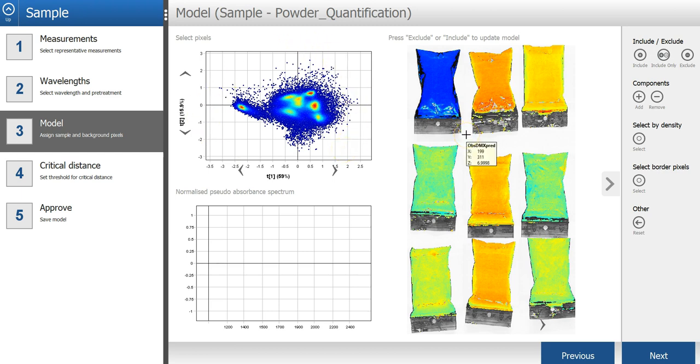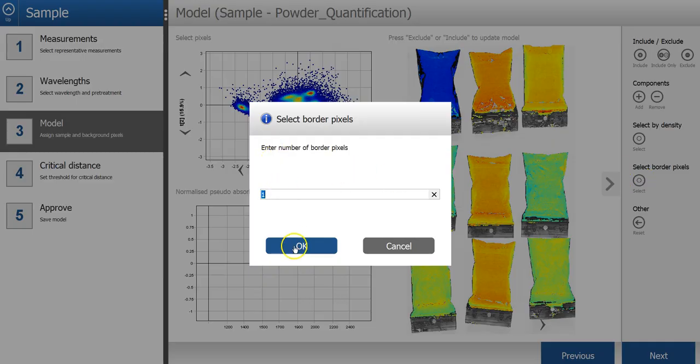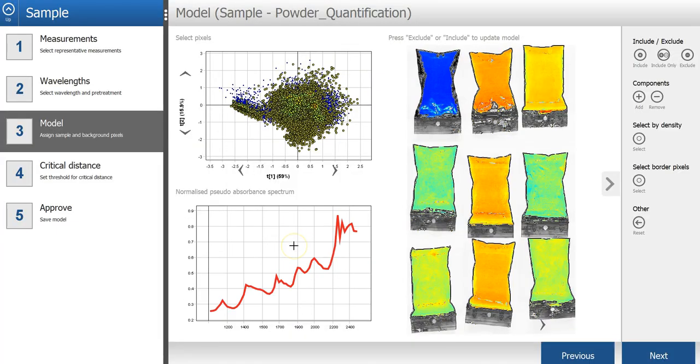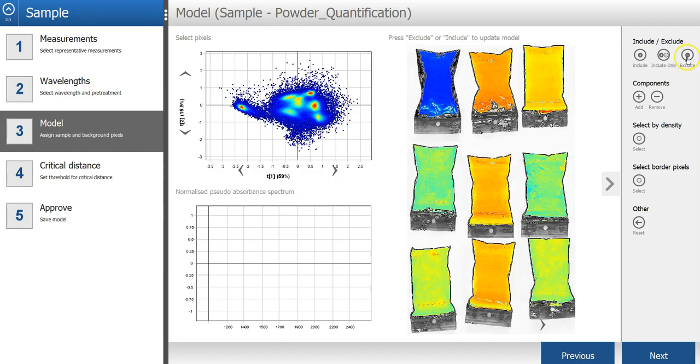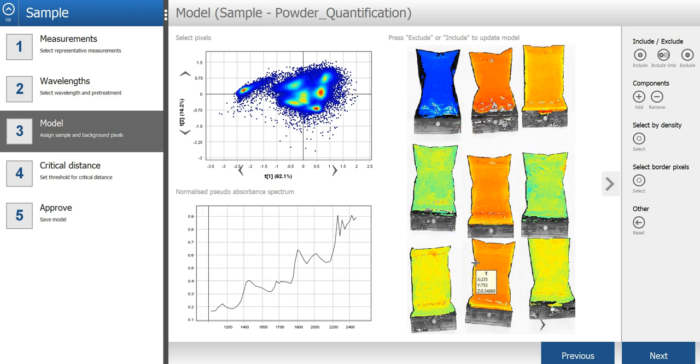To clean up the sample pixels even more, I can remove border pixels. Okay, I think this looks pretty good now. We have only included sample pixels here.